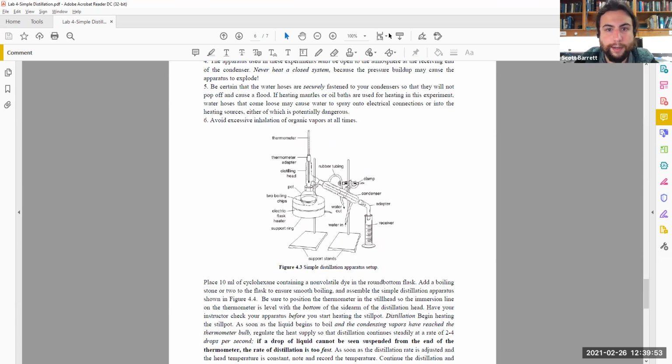And let me go ahead and stop the share here, so that way I can review to see if I have any other critical info. Make sure whenever you would be performing this to utilize grease on the little joints, so that way none of the glassware gets stuck and then you can't remove it after you perform your experiment. Additionally, whenever you clean, we always want to use firstly soap and water, secondly DI water to remove any sort of additional deposits that may be within the tap water in our sinks at the lab.